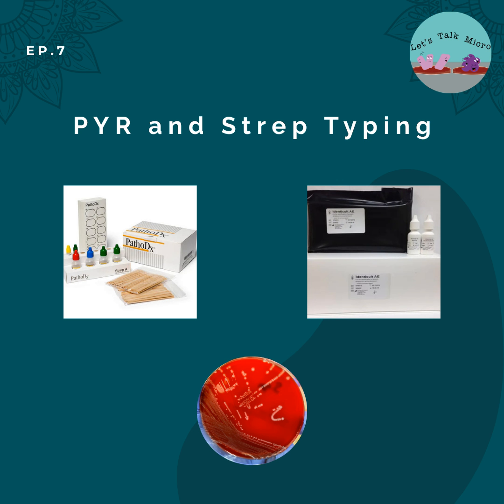Very simple test. You add a drop of hydrogen peroxide on a slide. Then you add your colony and then observe for bubbles. You can also add the colonies to the slide and then add the drop of hydrogen peroxide. What we need to take away from this is to be careful. A positive catalase reaction is supposed to be strong bubbles right away. So sometimes you can have the enterococcus give you a weak reaction, maybe 2 seconds in. You see tiny bubbles. This is what's considered a weak positive or a negative reaction. So keep that in mind, because if you call it positive, you're going to start going down the line of the staph, and that will be wrong.